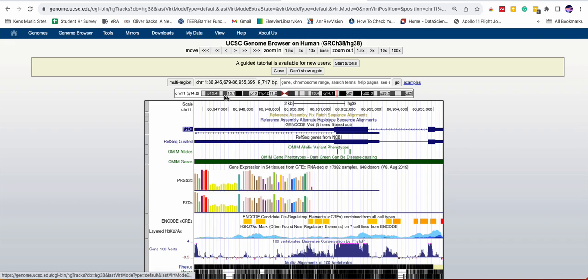But basically, there are sections banding from traditional staining of metaphase chromosomes. And these locations have these little map numbers on the P arm. They start with P. The numbers are smaller as you go to the centromere. They get larger as you go to the telomere end. Same on the Q side of the chromosome. These locations were used for mapping genes in the past a little bit more than now, but they are handy landmarks for sort of knowing where you are in the chromosome.